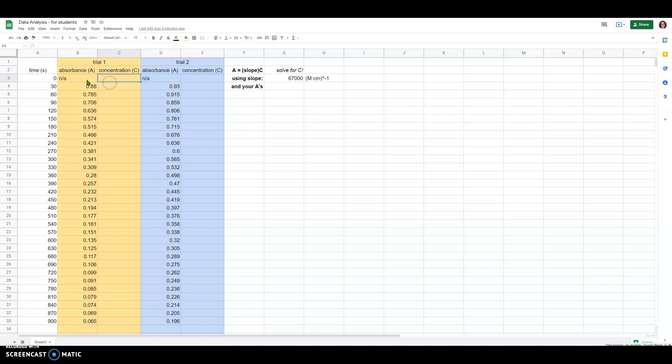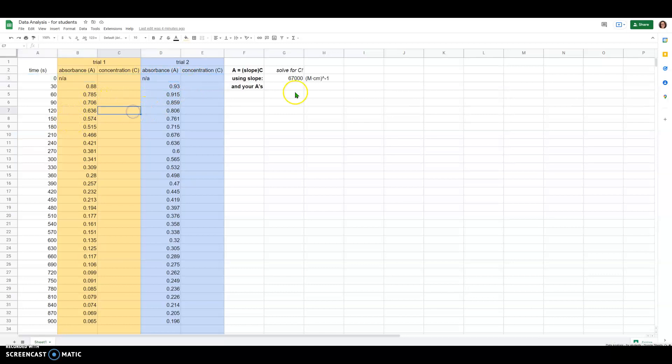I've left it in here just to make a point of that, but you can literally just delete that row of data and not include it.